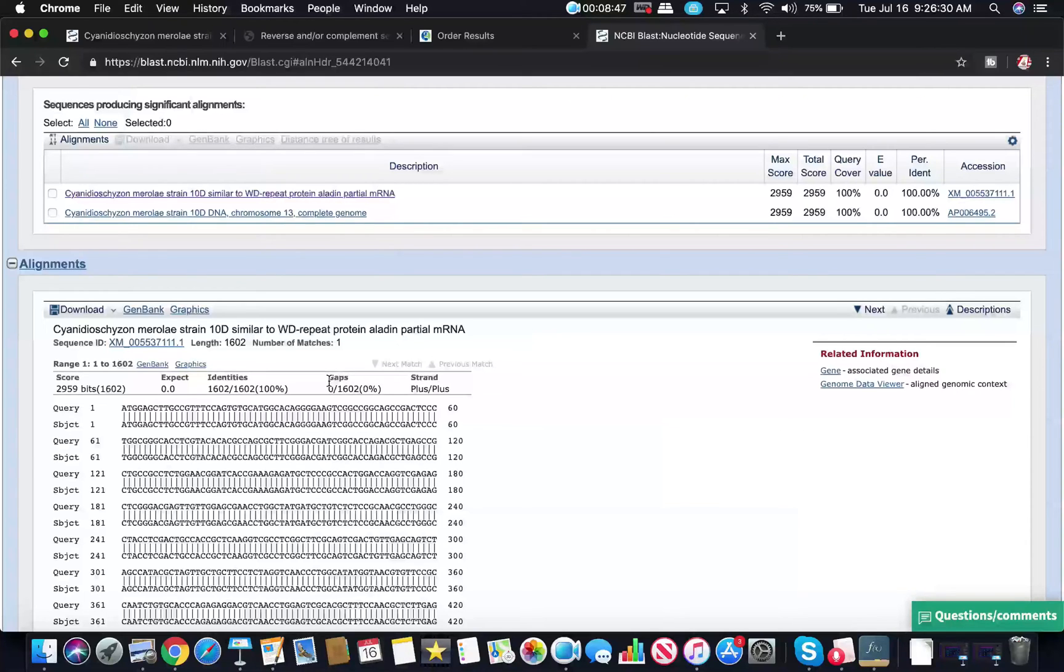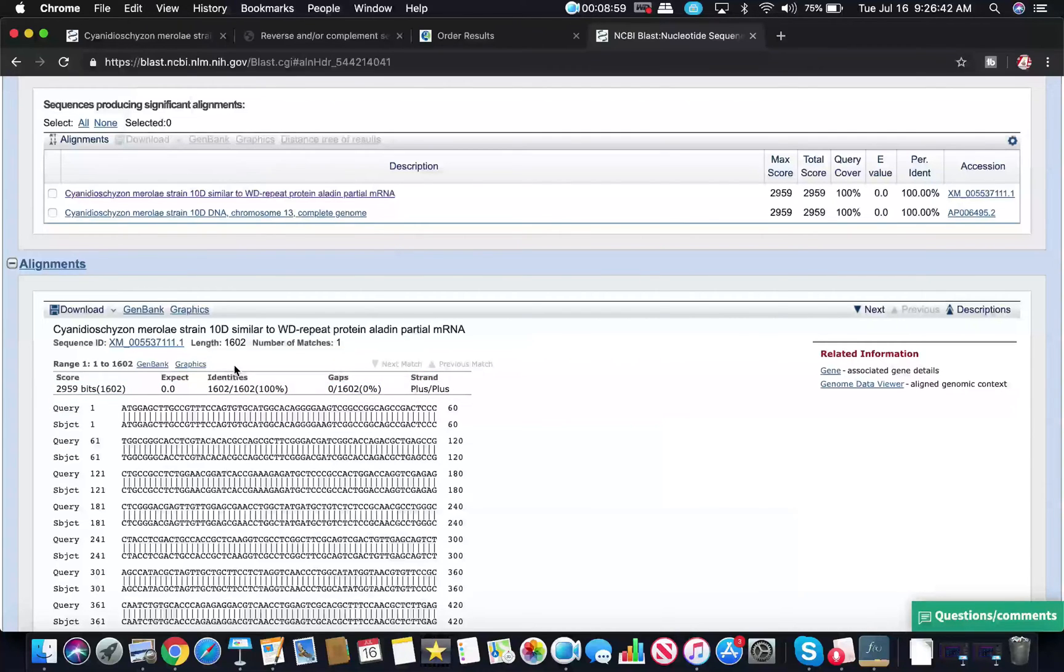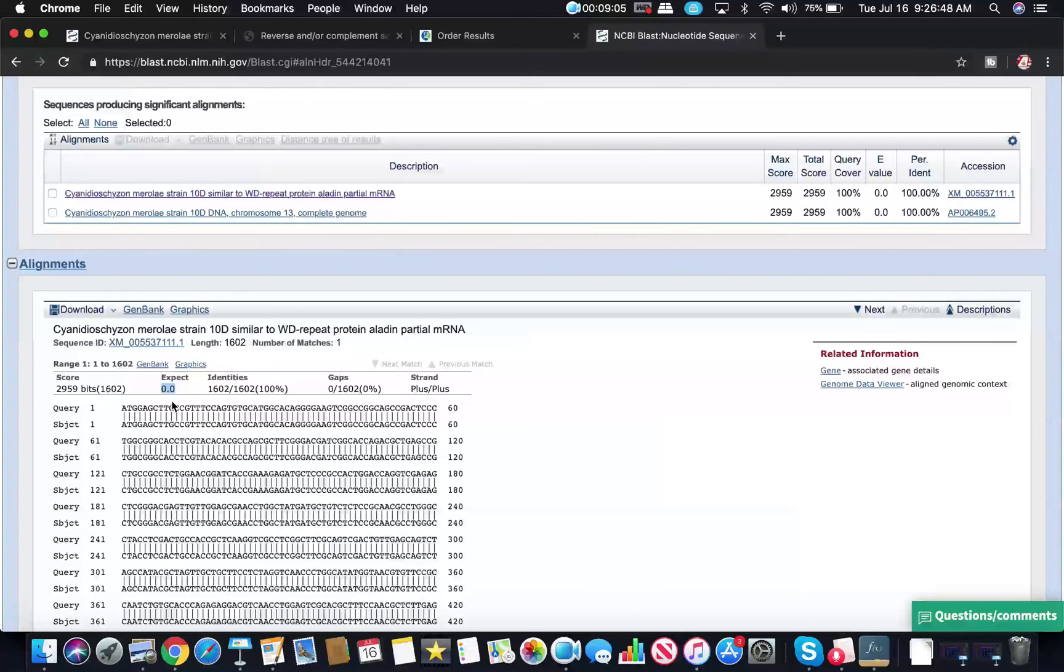Gaps you want to minimize those. Sometimes just by nature, if there's hairpins or things like that, there can be gaps introduced that aren't naturally there, but you want to minimize the number of gaps. Also, this expectation value is a statistical measure. You want this to be as low as possible.